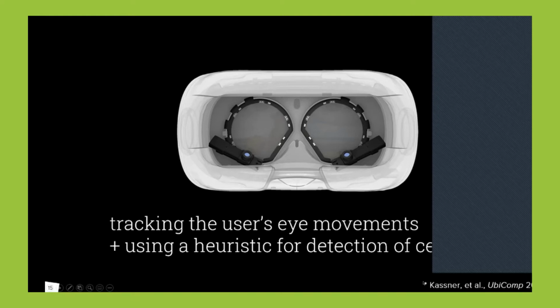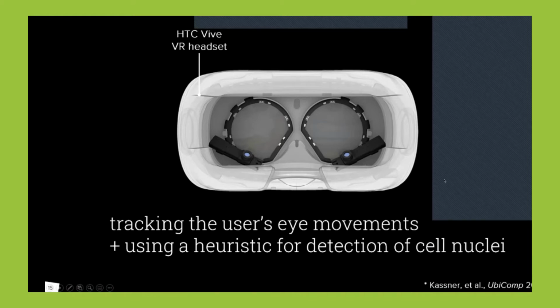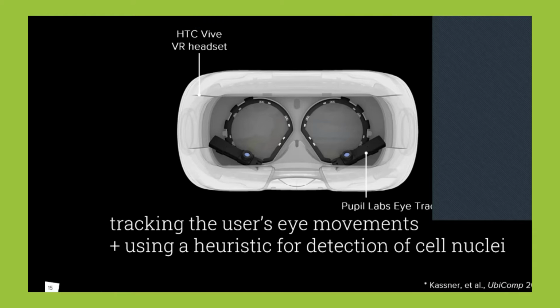What I should also mention is that these eye trackers that we are using in the HTC Vive originally come out of an academic setting, but a spin-off company named Pupil Labs has now been formed, and you can buy these eye tracking cameras for around €1,000, or you can 3D print everything yourself, and the cameras are just off the shelf. So if you want to do the entire thing on your own, you can do that and just download the software from GitHub. This is a super low barrier setup, and in terms of lab costs, €1,000 for an eye tracking setup is also pretty manageable. I think these kinds of things will become more ubiquitous in the following years, so you will probably see a lot of VR headsets with eye trackers coming up. Okay, as you've come for the bionic tracking thing and not just for me ranting on about user interfaces and eye tracking, let's have a look at how this looks.